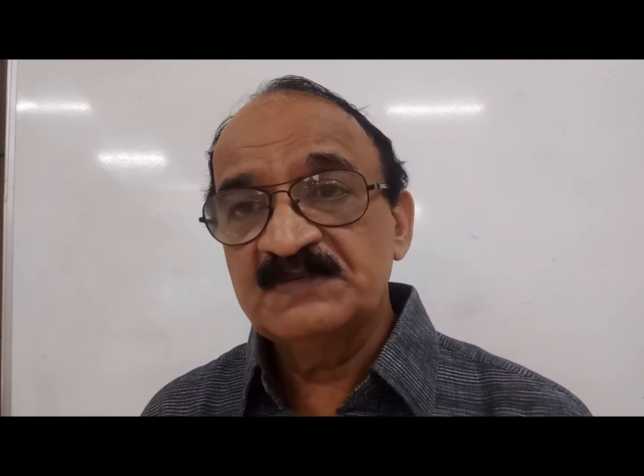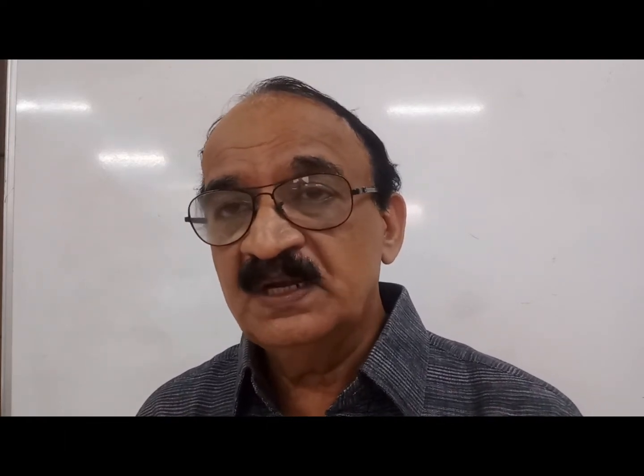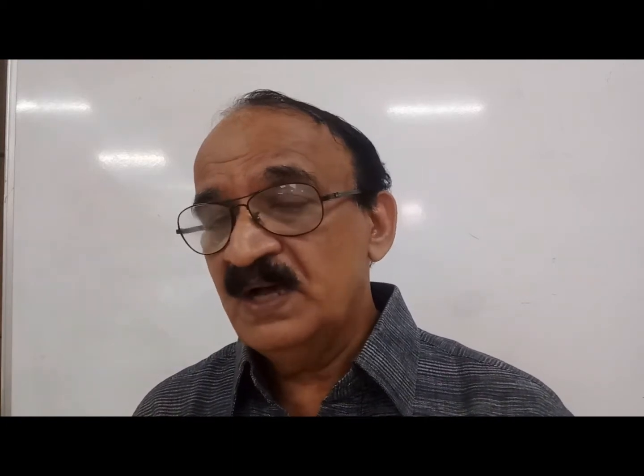Well, my students, we have covered the theory of NMR, the chemical shift, the factors which influence the chemical shift, and spin-spin interaction or spin-spin coupling, commonly called SS interaction or SS coupling. Right? Now we can pass on to the interpretation of NMR. That is very important. Interpretation.